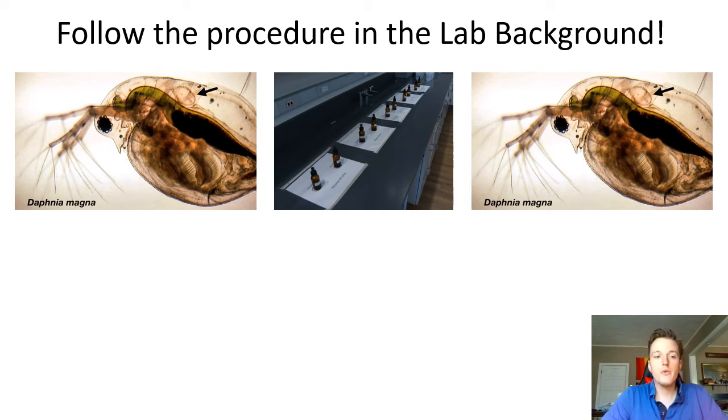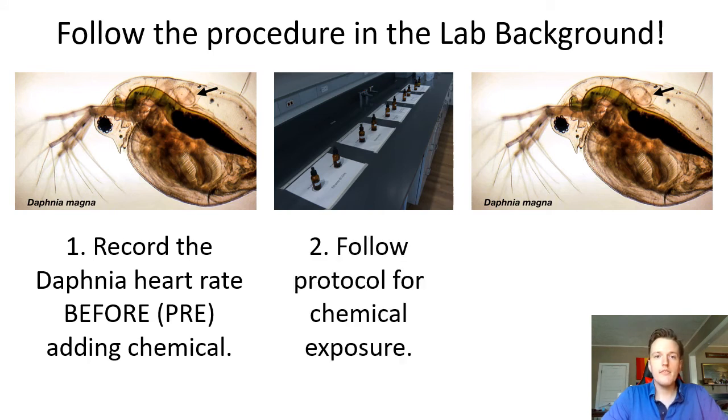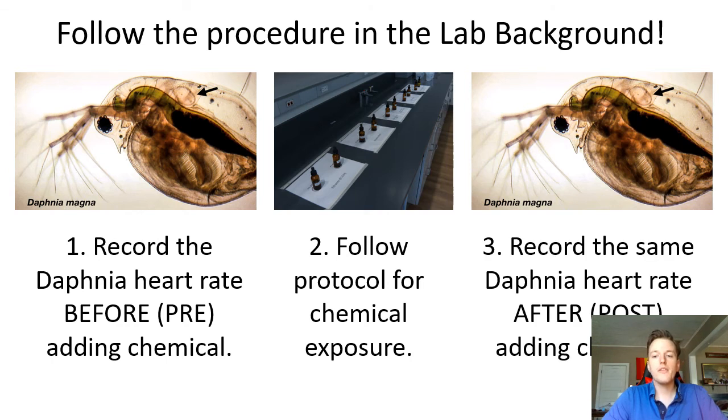So you guys are going to get a couple of videos with the different chemicals where you're going to have to go through and record the before heart rate for the Daphnia. There'll be a gap and then the chemical exposure, and then you'll come back and record the same Daphnia heart rate after adding the chemical.